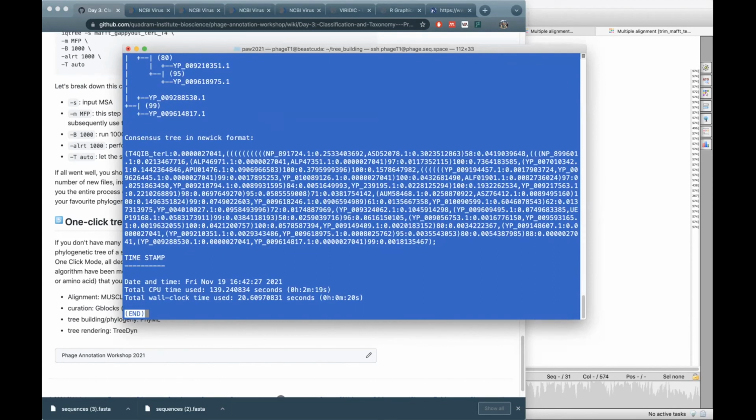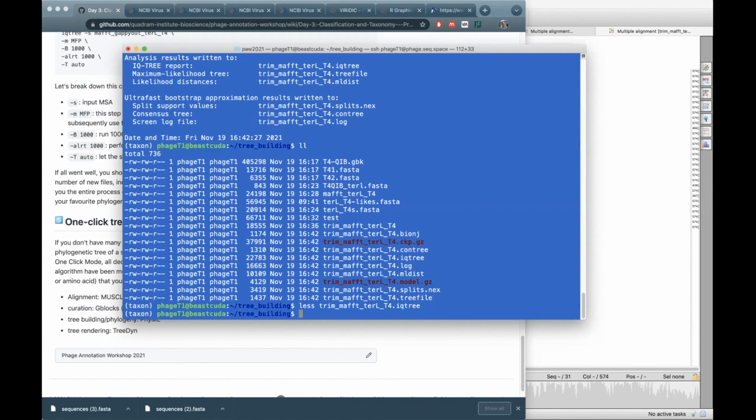Okay, we have reached the end of our IQ-TREE file. So the consensus tree is now present as the tree that ends with .contree. And the original maximum likelihood tree is present as the .treefile. So that's free for everybody to view in their favorite tree editor or whatever. I am a person who uses iTOL, but iTOL has become paying software if you want to save your stuff.